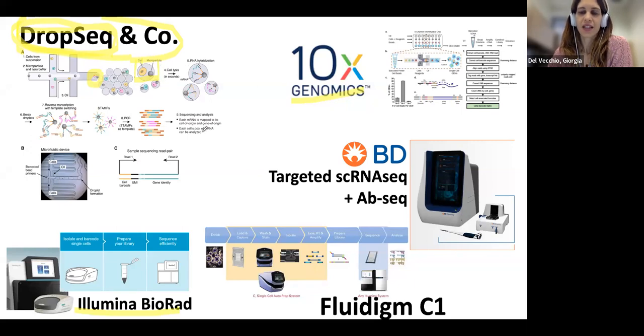However, everything else is similar. The microparticle is carrying the adapters. It's still a poly A capture, so you have the oligo dT plus the adapter attached to this support.